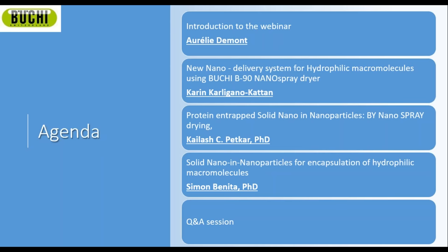What is going on in today's webinar? The introduction will be made by Aurélie Dumont. Then Karin Karligano-Katan will speak about a new nano delivery system for hydrophilic macromolecules using the B90 nanospray dryer. Then Kalyash Petkar will speak about protein-entrapped solid nano-in-nanoparticles, also by nanospray drying, which is the main subject of the webinar. At the end of this part, Professor Simon Benita will speak about solid nano-in-nanoparticles for encapsulation of hydrophilic macromolecules. And then at the end, there's going to be a Q&A session.